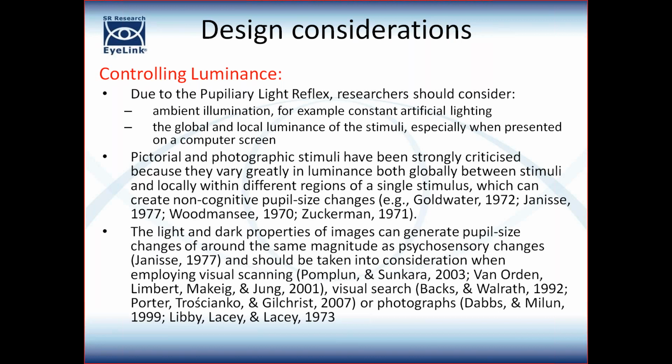So normal artificial lighting is fine, and if you have got windows in your lab, if they've got decent blinds or decent shutters, that should be absolutely fine.